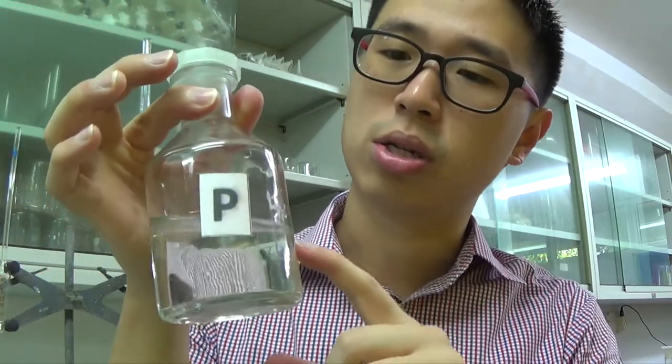So in a real exam, iron 2 solution is always prepared quite fresh, a day or two before the actual exam, because if you leave them for a long time, they do actually get oxidized to iron 3 in solution, okay? But the sulfuric acid helps to slow down that reaction a lot.